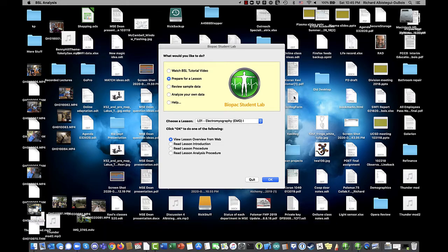It can't run the BioPack machine, which is perfect for this online sort of lab session, because it means that you can have the software and do the same kind of data analysis you would do in the lab, which is part of what you're learning to do in a science course like this. So what I'm going to show you today is how to use that.